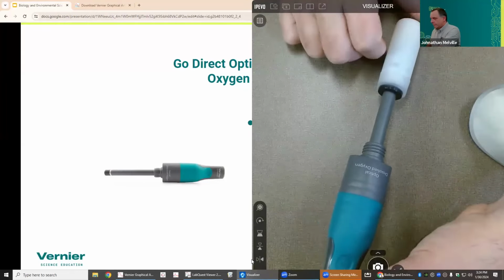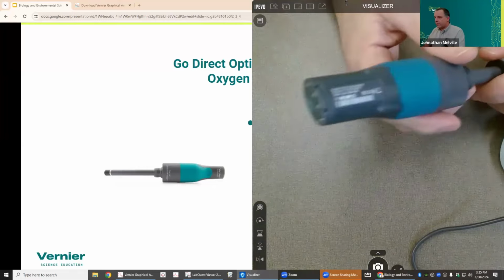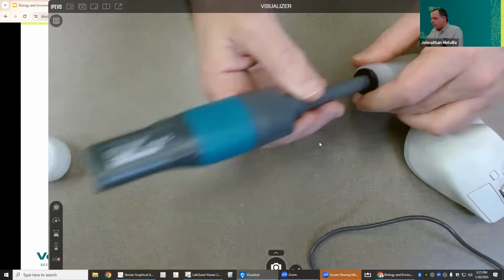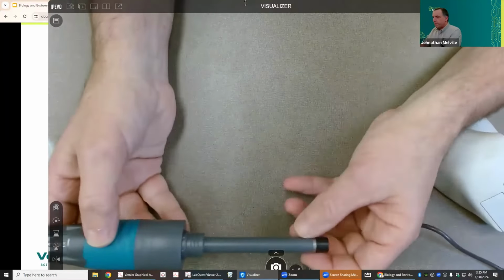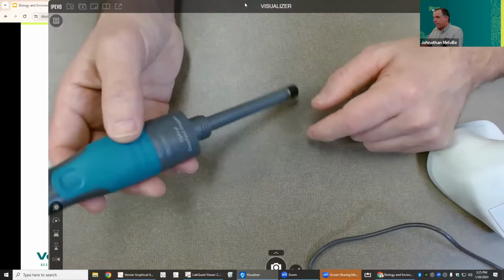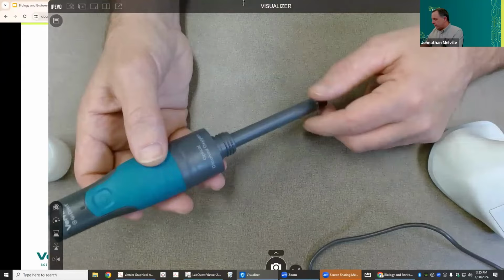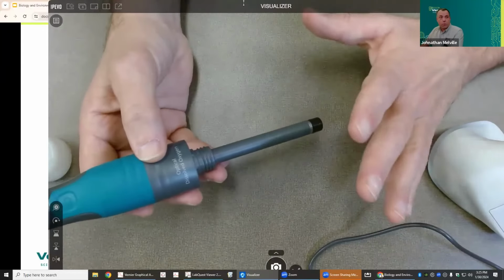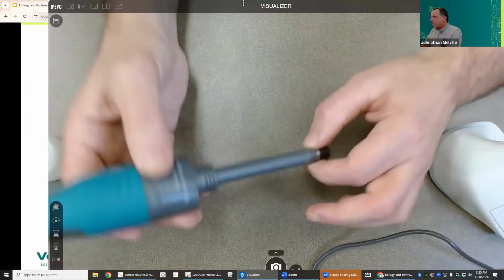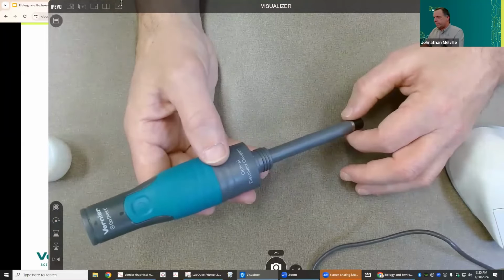What I love about it is it's so simple to use. Has anyone here actually used a dissolved oxygen sensor before that doesn't use optical technology? I remember using ones that had a fluid that you had to put in the cap, and then you had to let them warm up, and then they wound up consuming oxygen. Really challenging, really hard to use. I could get them to work, but they were always problematic, or I felt like they could be problematic, not fun. What's great about this sensor is all that you have to do is put it in water and measure. That's what's awesome about it.